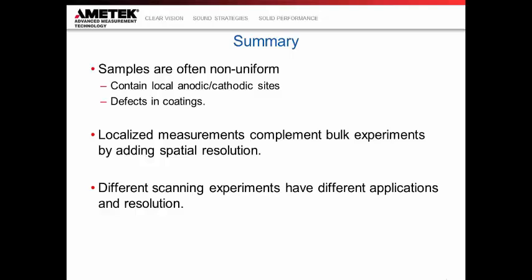I would not present to you that SVET should be the only piece of your electrochemical corrosion or your corrosion studies. I think this tells one very valuable piece of the equation, but so do the Tafel plots, and so do cyclic polarization and LPR and galvanic corrosion, the different types of electrochemical corrosion measurements, but also weight loss and atmospheric exposure and these other types of non-electrochemical lifetime tests.